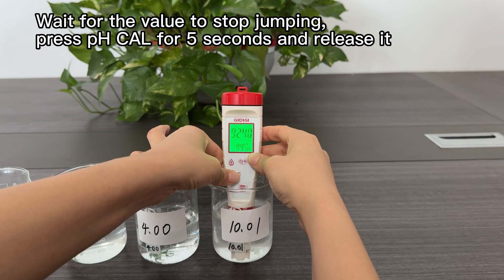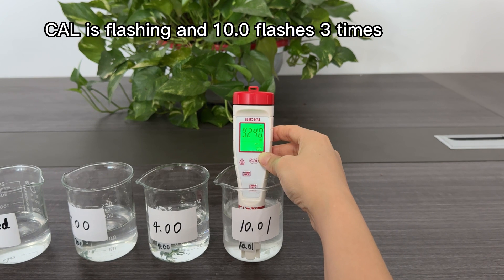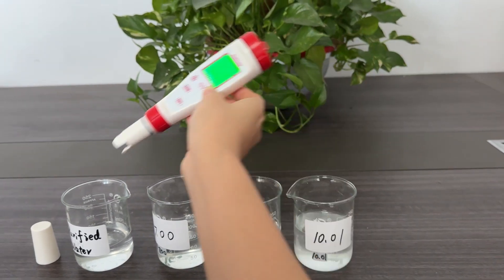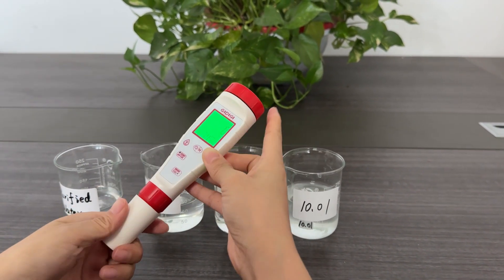Press the pH calibration button for 5 seconds and release it. CAL is flashing and 10.00 flashes 3 times to confirm calibration. Clean the probe with purified water, wipe it, and put the cap back on.